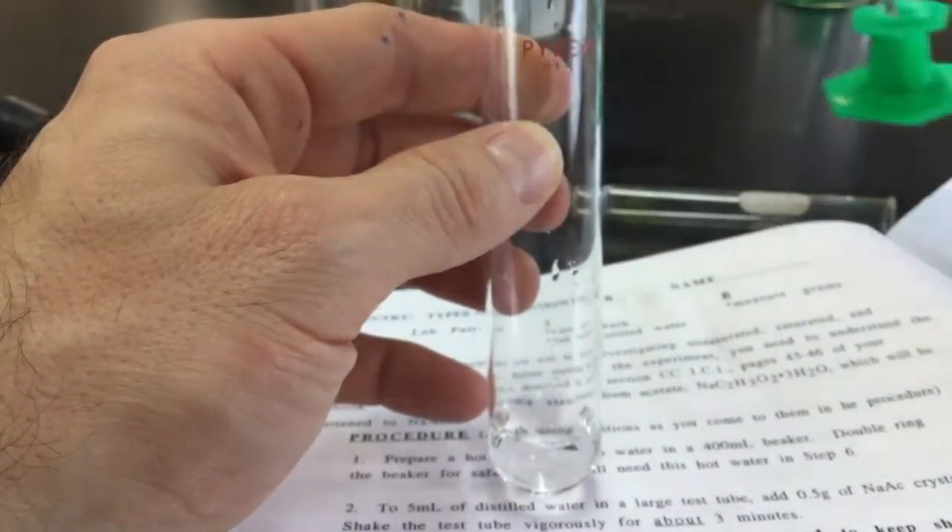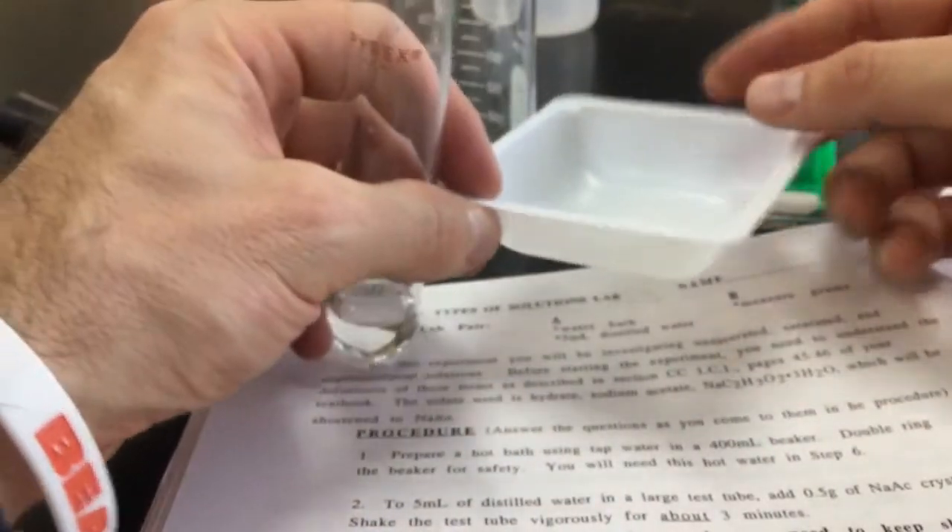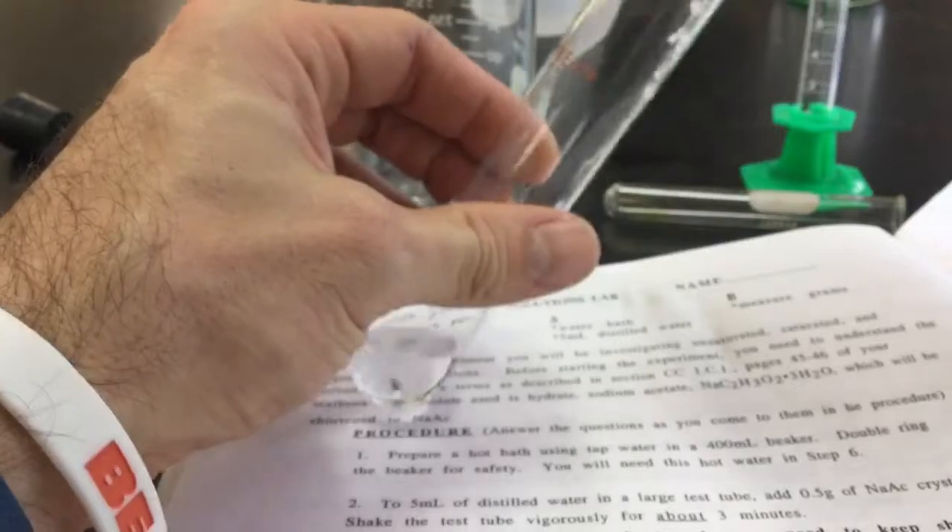You're supposed to measure out 0.5 grams of the sodium acetate. So I've got the weigh boat here, you've got the sodium acetate. I'm going to fold it up and enter it into the test tube.